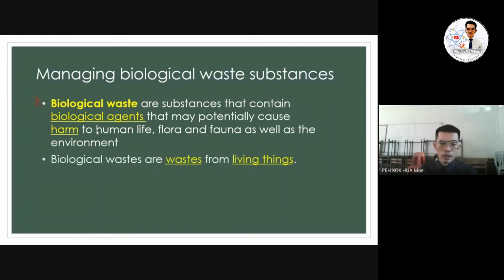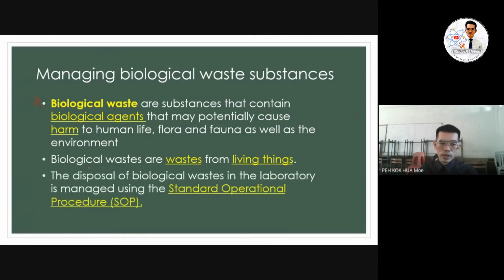Okay, so biological waste is waste from living things. The disposal of biological waste in the laboratory is managed using the standard operational procedure, or SOP for short. So we have our SOP for handling our biological waste.